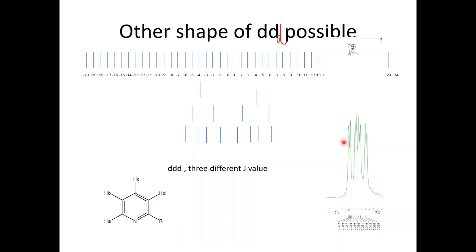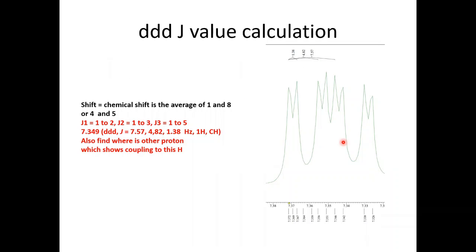How you calculate the J value in this system? This is an 8 peak. Just click on this one, click on this one. You will get the difference multiplied by the frequency of spectrophotometer. You will get 1.38. Click on this one, click on this one, peak two, peak three. You will get J value.